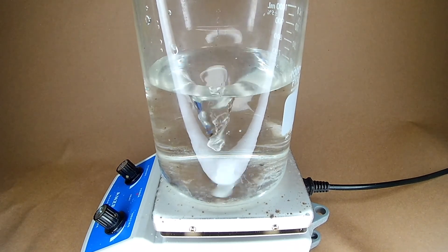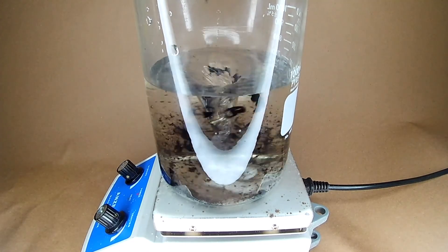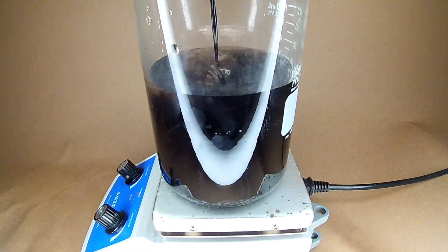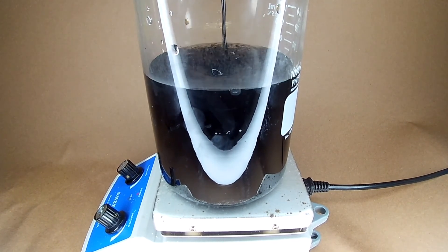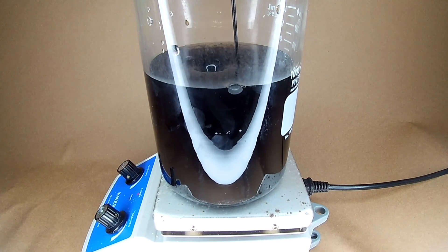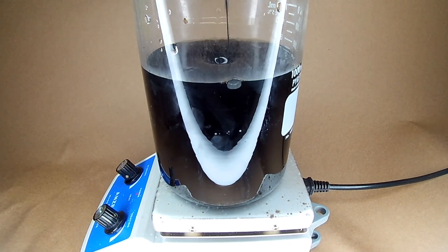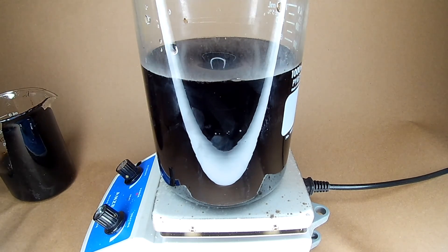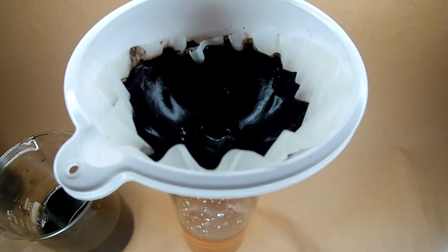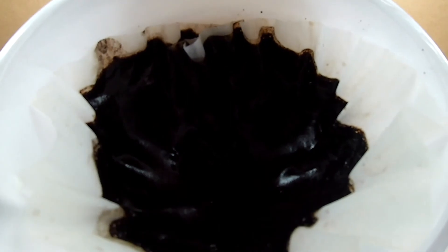Let's see what happens when you dump the whole thing in. And it's black. The cellulose was very slow to strain out, and the liquid was left an orangey color. Black sludge.